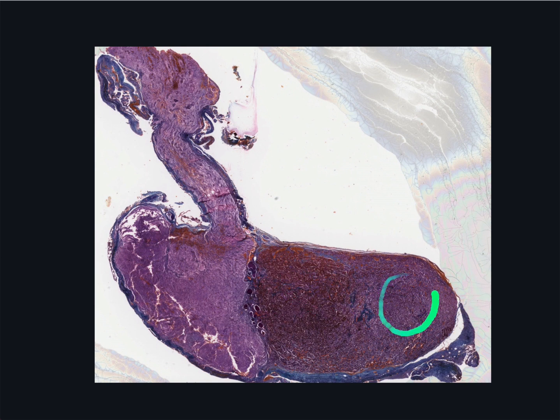Each of these three classes of cells is heterogeneous with respect to their hormone secretions. Basophils include the gonadotrophs, thyrotrophs, corticotrophs, and residual melanotrophs. But these individual cell types are too difficult to distinguish by the conventional stains we use here. The acidophils include mammotrophs and somatotrophs.